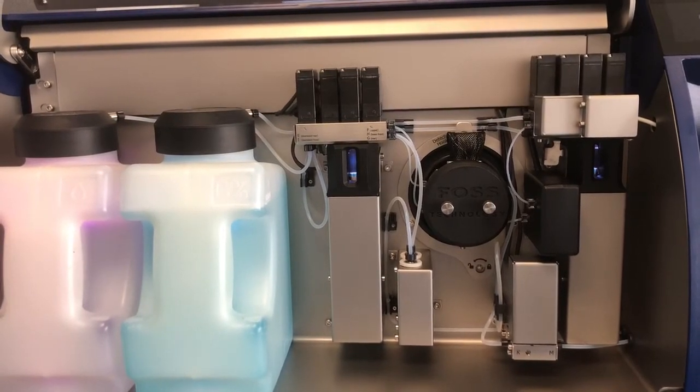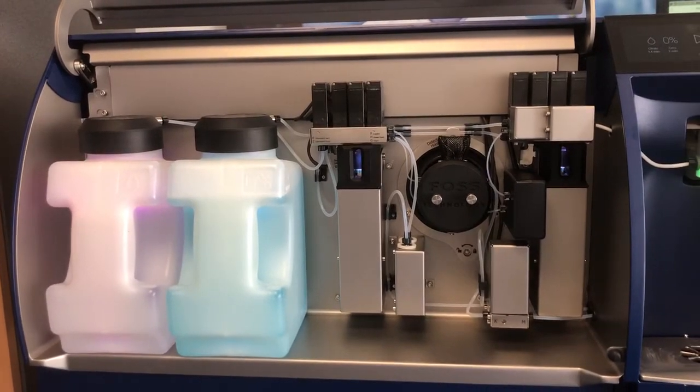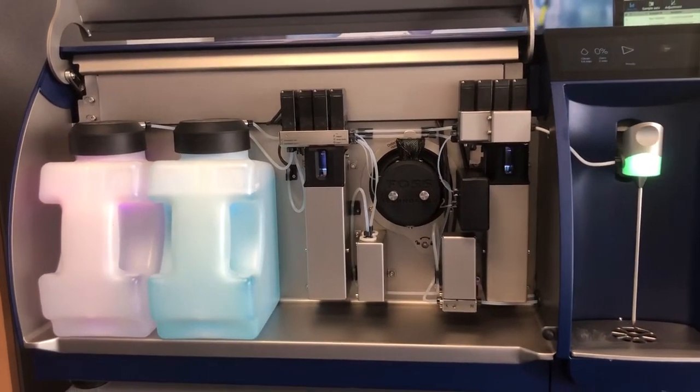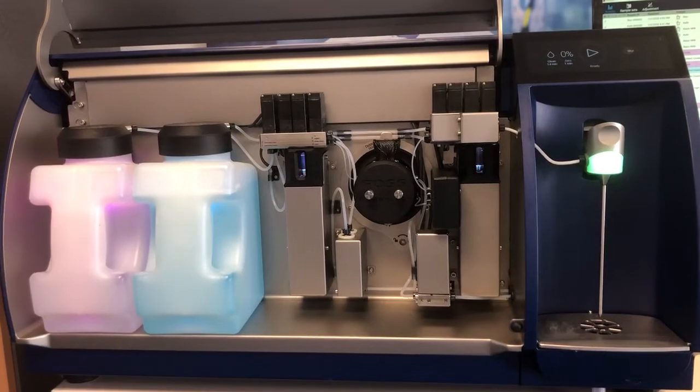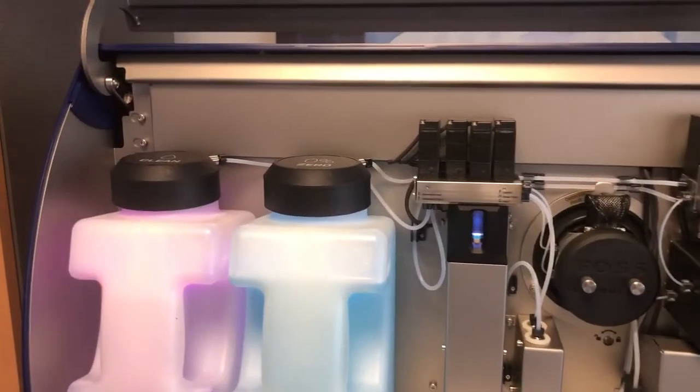The instrument auto-standardizes every two hours on the zero setting. The zero is now a gold mine of information that we use with our chemometrics and smart analytics of the FT3.